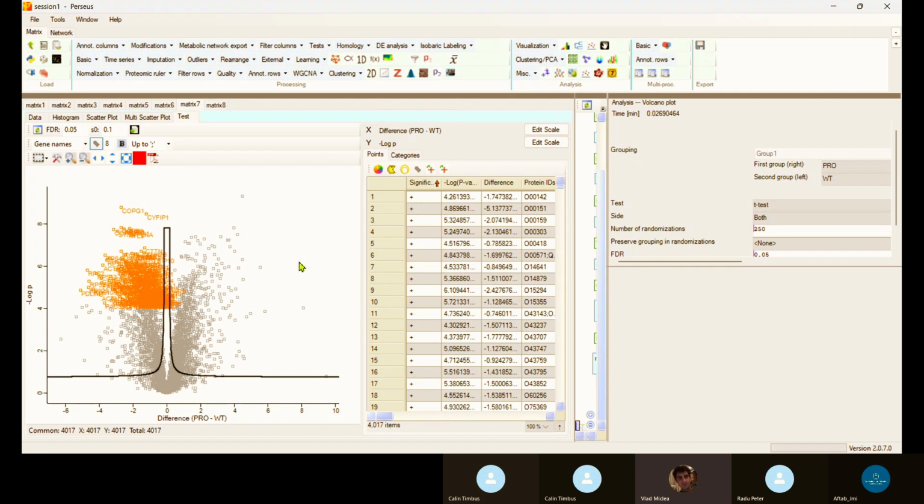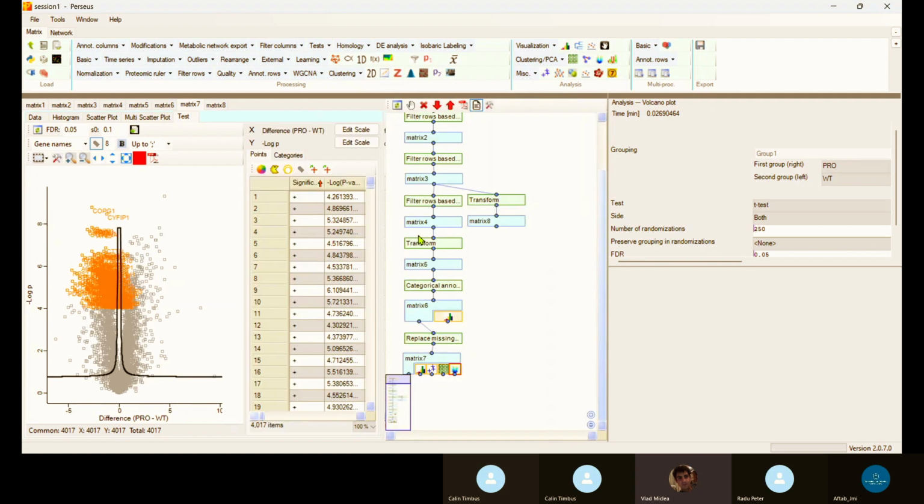I have a little bit more technical question. Sorry for interrupting. What if we wanted to include our own transform? Let's say we have written in R or in C a transformation of data that would be useful to be integrated in here. Is there something like introducing a custom transform?